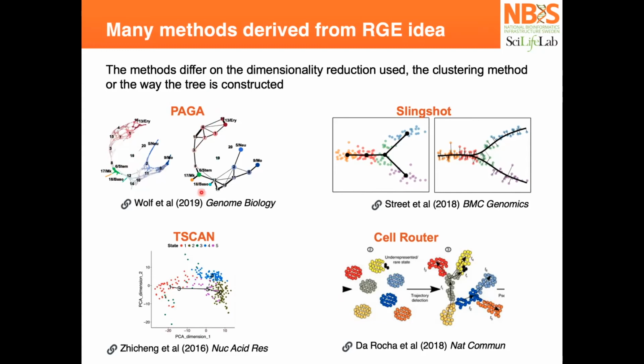And from that, you can define where your progenitor is based on some markers, which are here. They're labeled stem. And then from that, you can define the trajectory from here, and through all these paths in your graph. And for Slingshot, it is exactly the same concept. So if you have your data, then you define some clusters throughout the whole data space, as long as they are connected like this. And then from the cluster centroids, you can connect all the different cell lineages that you have there.